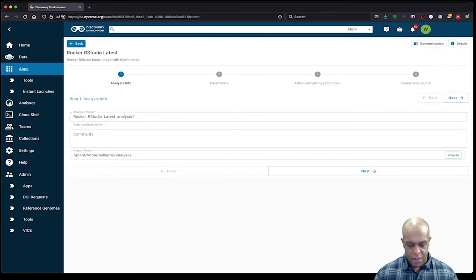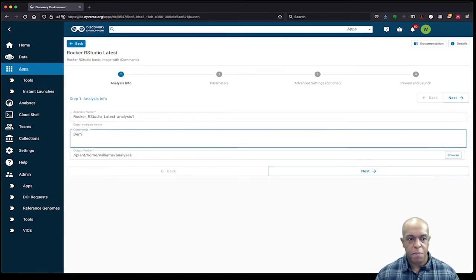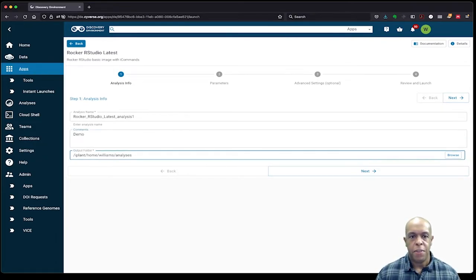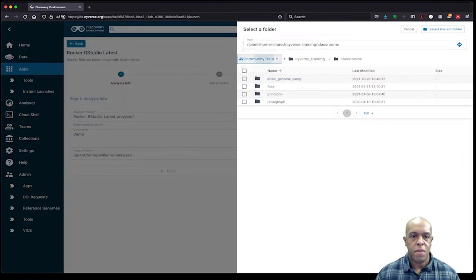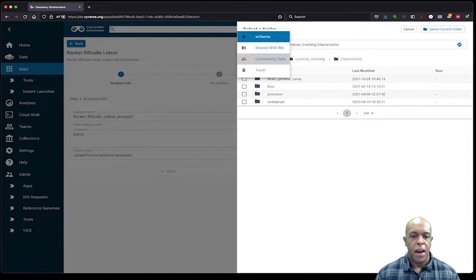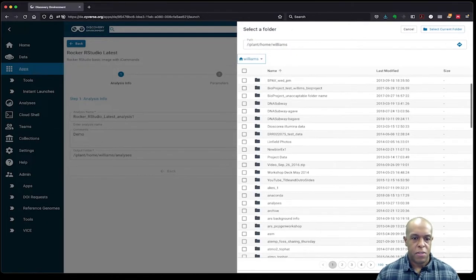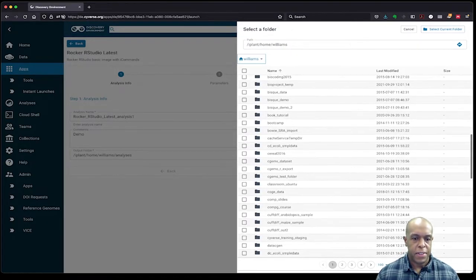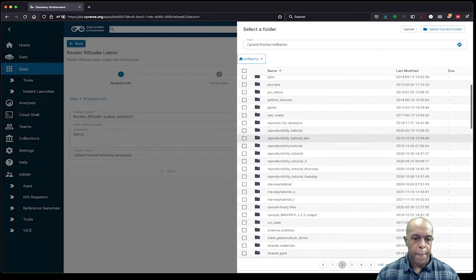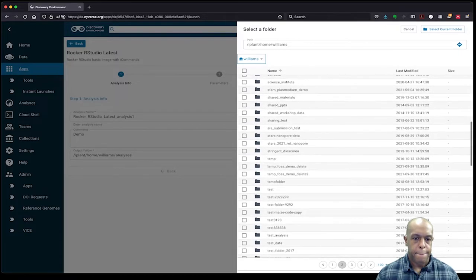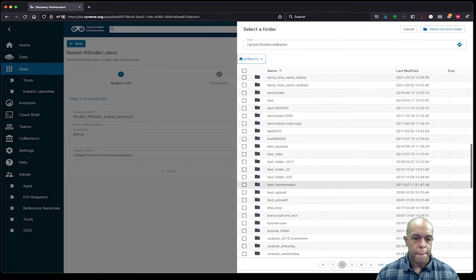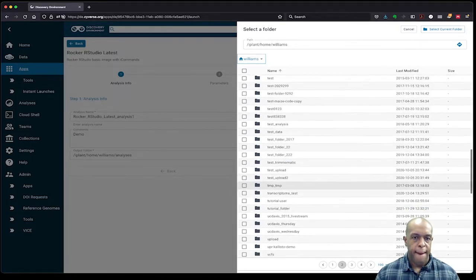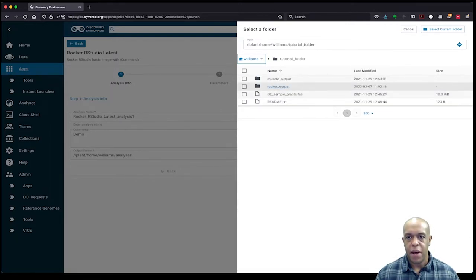Okay, I can just call this a demo in my comments, and I'm going to choose the output folder to be the folder that I just created. So that's going to be back in my home Williams, and that's going to be actually in tutorial folder. And I'm going to choose that rocker_output. So I'm going to check box select that and say okay.